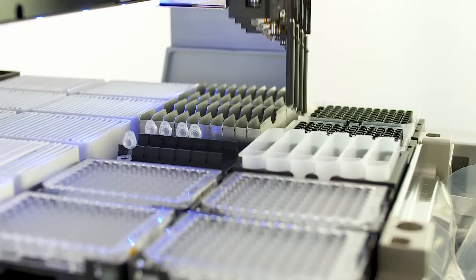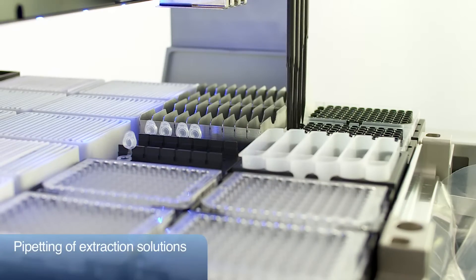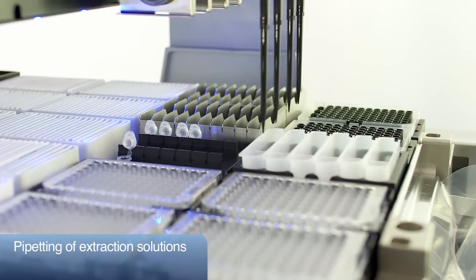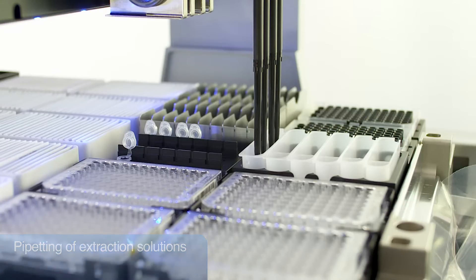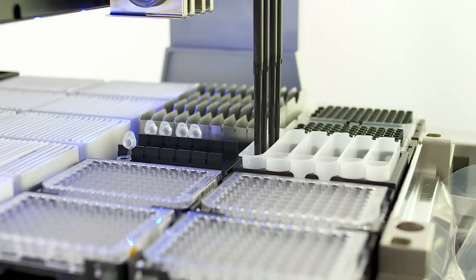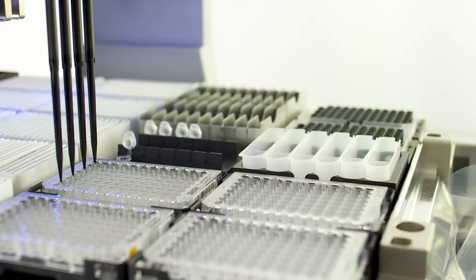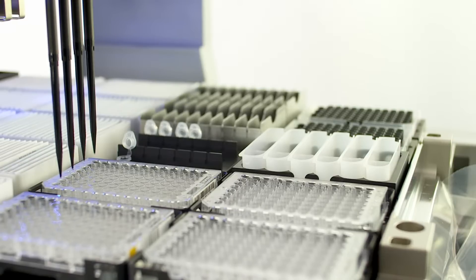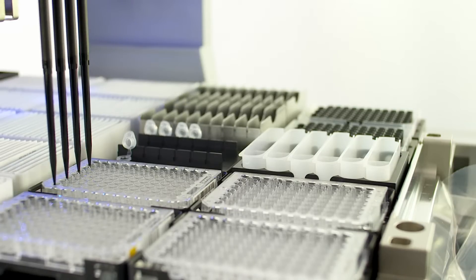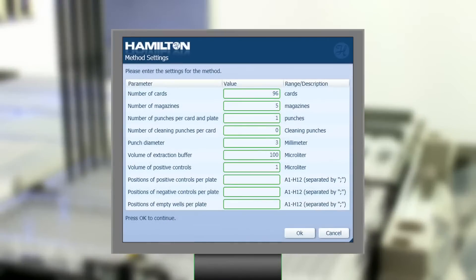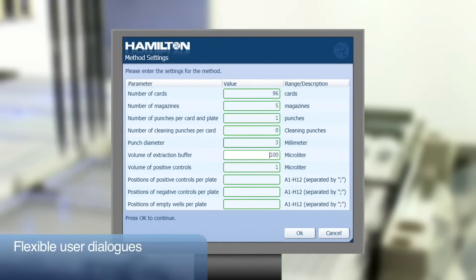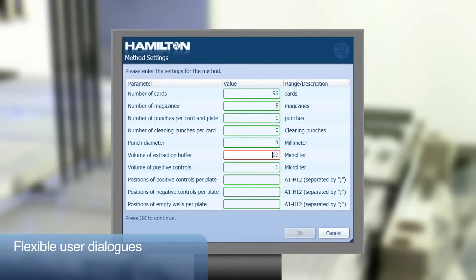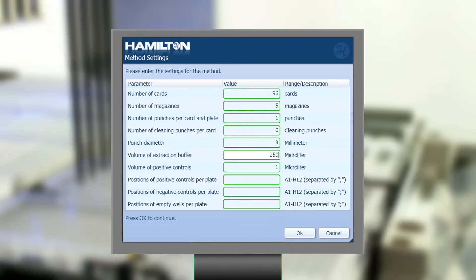Extraction reagent can be added to all positions required. The different troughs allow for a variety of extraction solutions that can be used for individual samples within the same method, making the EasyPunch a flexible tool for method development. The software is flexible enough to allow modifications in your assay, for example, different volumes of reagent.